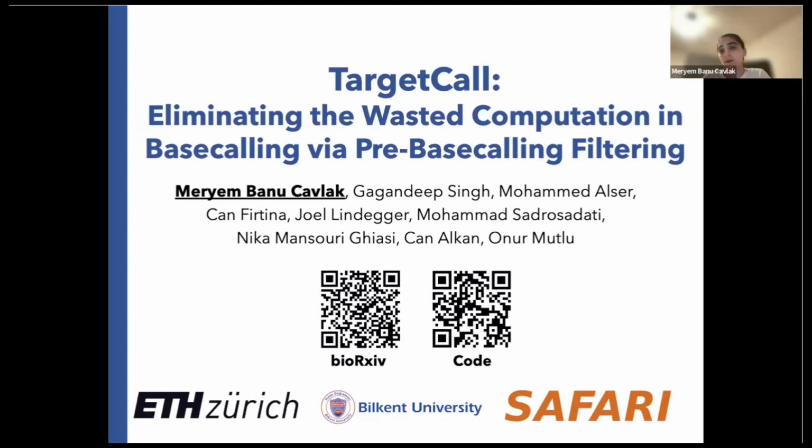No, actually, for example, in this viral use case, we have 10 different viral reference genomes in the target reference, and the precision doesn't get worse. We didn't extensively test it across maybe 100,000 reference genomes, but I don't think so. As long as Minimap2's precision is good, it will have good precision.